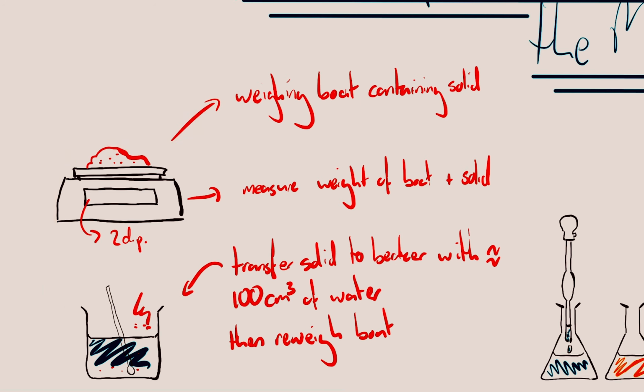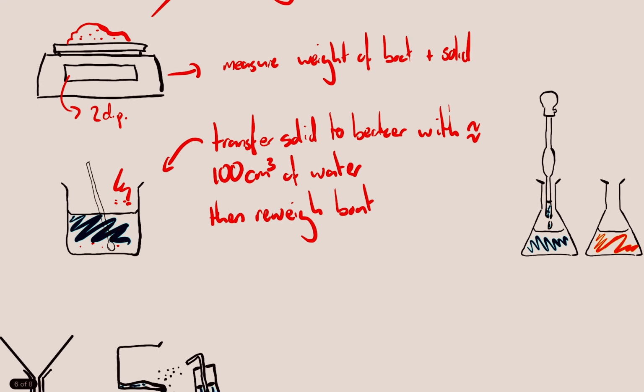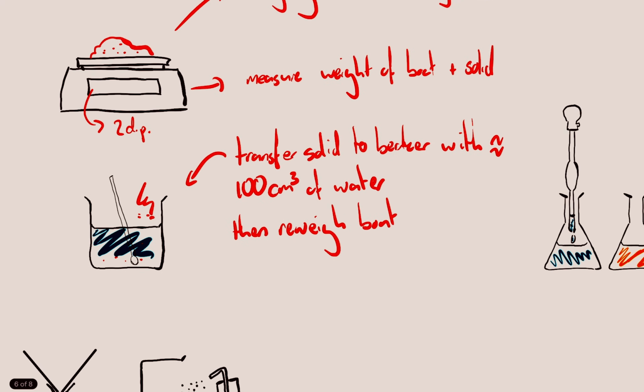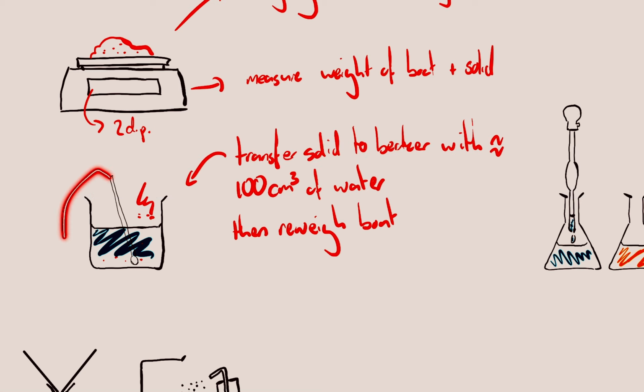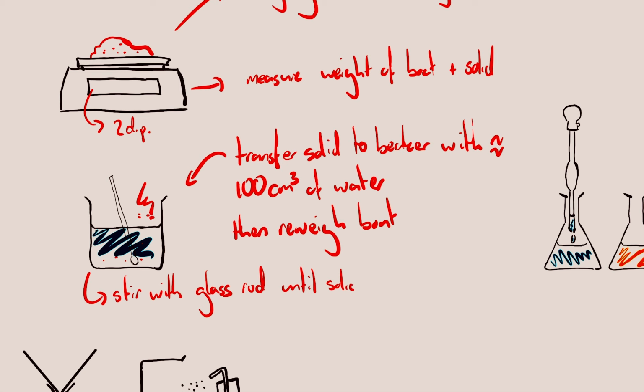Okay, once we've done that, we're then going to stir our solution with a glass rod until solid dissolves. That's our next step, okay?